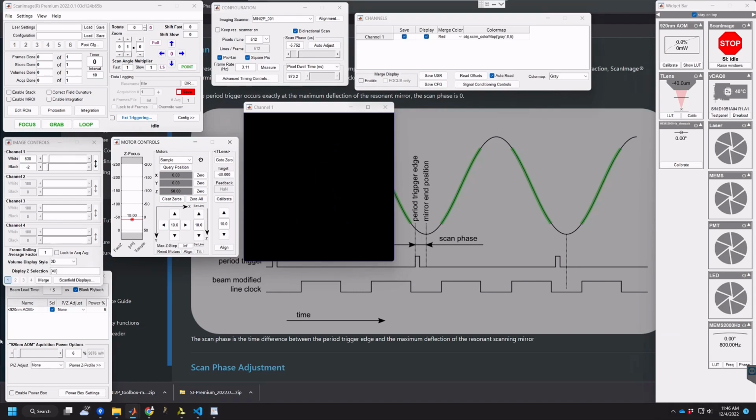Also worth noting is, rather than adjusting the microT lens position via these up and down arrows or by editing this editable text for the target position, you can actually, if you hover your mouse over this graph, and if we set an appropriate increment from here, maybe you want to move 1 micron at a time, you can just scroll with your mouse wheel to change the FastZ position or your microT lens focal point while you're focusing, and you can find regions, or slices, of the sample that you would like to image at.